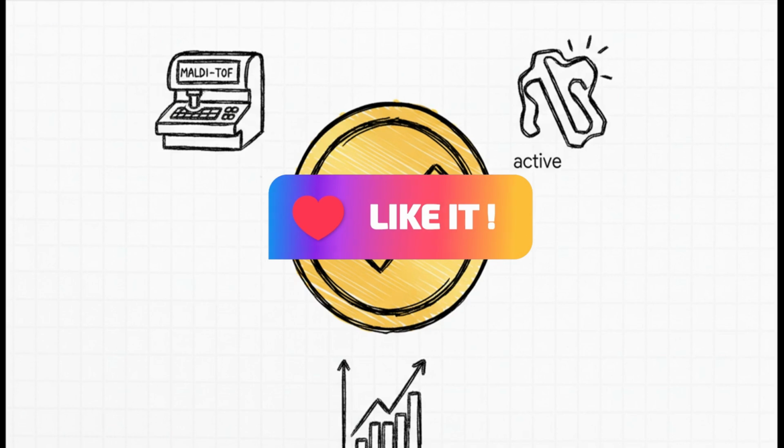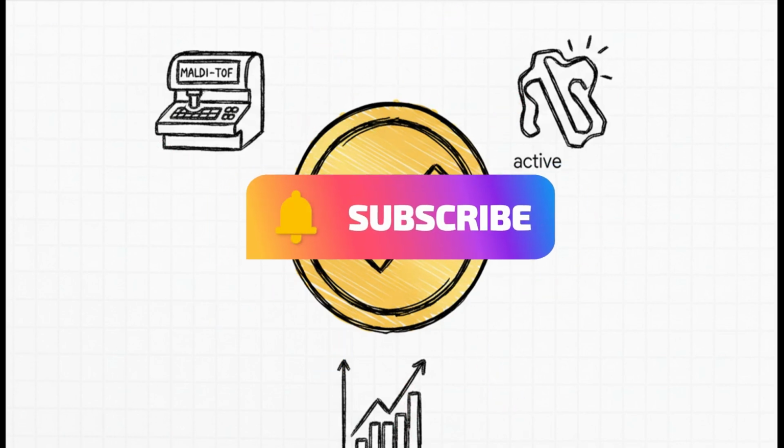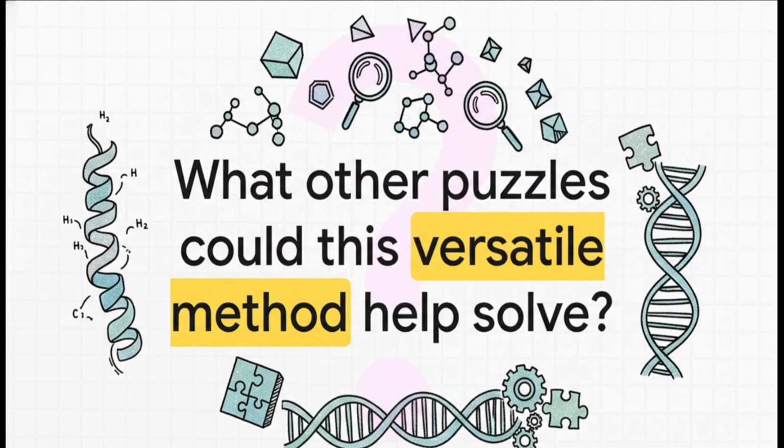And the takeaway? The method works. It's a legit, practical tool for scientists. So this just opens up a whole new way of seeing things. What else will we discover?